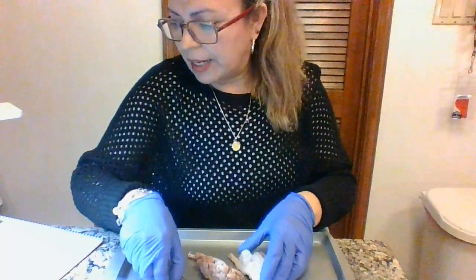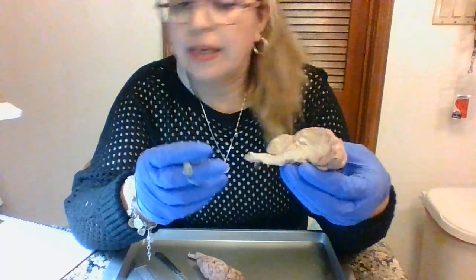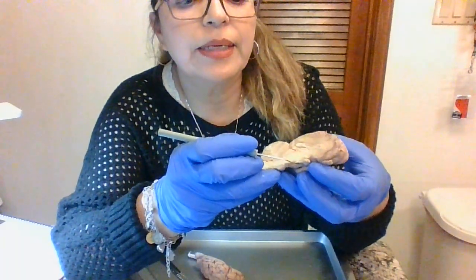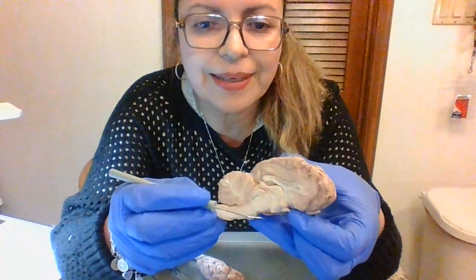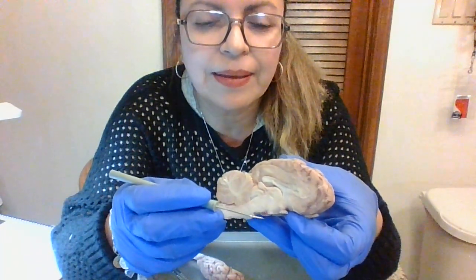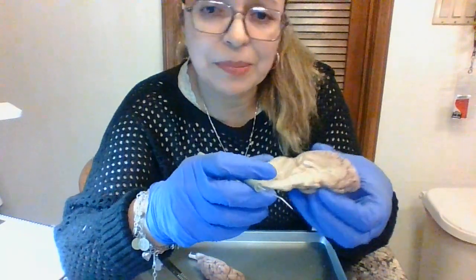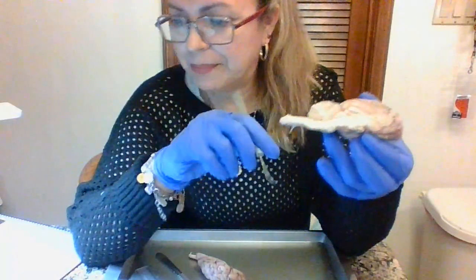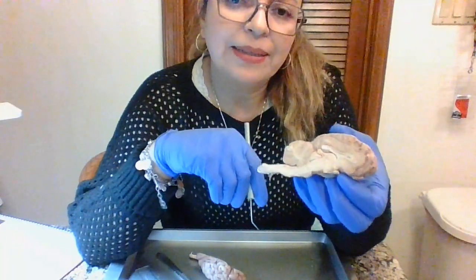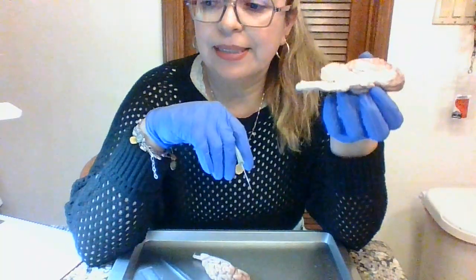The next thing we have is the hypothalamus. The hypothalamus is right here. Okay, that's the hypothalamus. Excuse my accent. The hypothalamus regulates body temperature, appetite, and fluid balance.